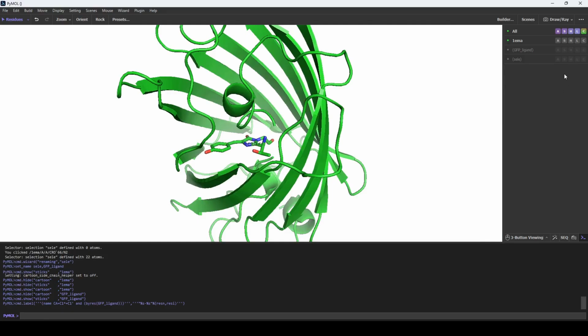The last entry for the objects entry is the color, labeled C. This applies color to the object. The color scheme for the ligand is color by elements. To change to a bright red, I will select color, and in this drop-down, click red.